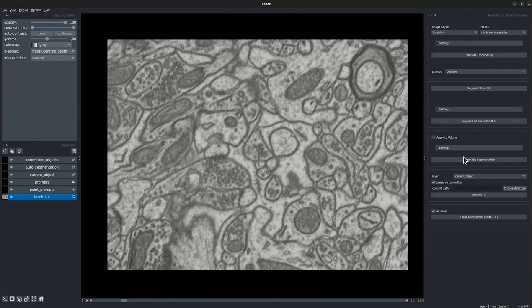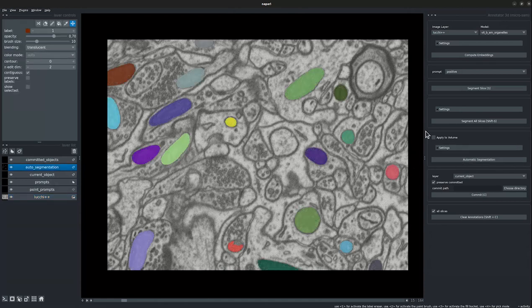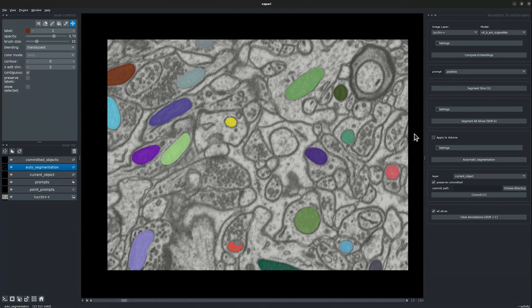Now let's go ahead and do automatic segmentation for the current slice. This takes a few seconds, and this was segmented only for one slice. We see that there are some incorrect segmentations. Now let's go ahead and apply this to the 3D volume. The automatic instance segmentation state has also been pre-computed, so the segmentation for the end-to-end volume would take under a minute.